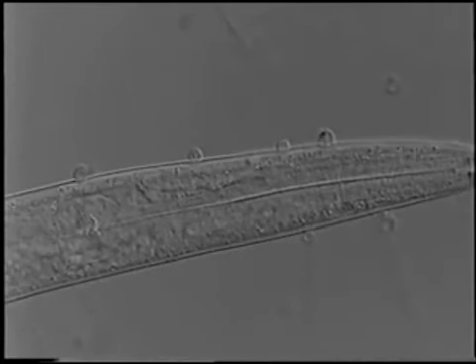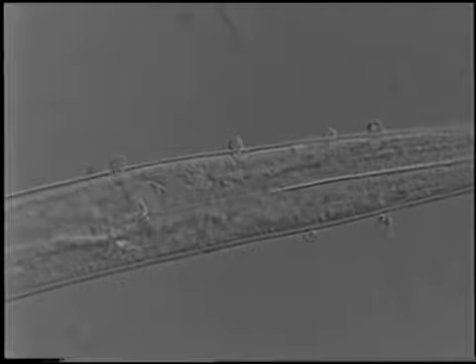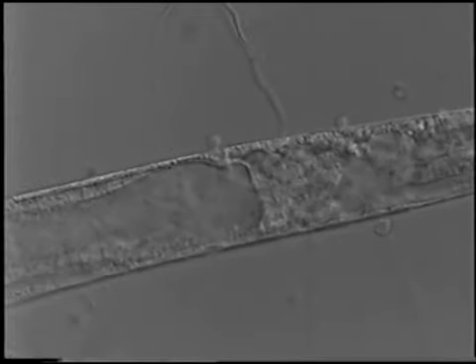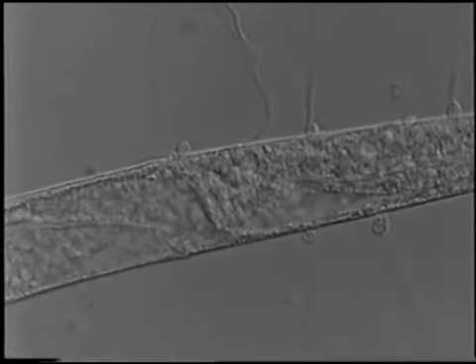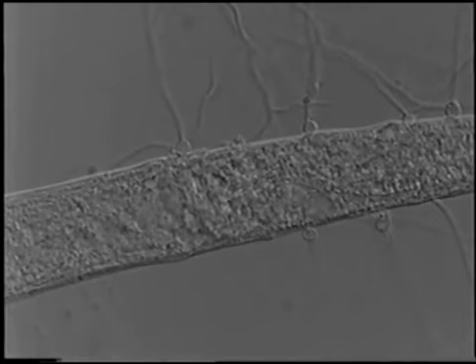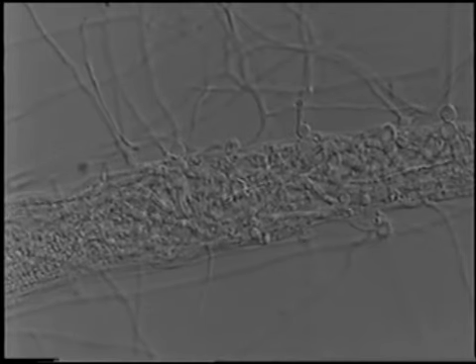When the infection bulb is fully developed, the collapse of the internal structure starts. Subsequently, vegetative hyphae develop within the nematode, and at the same time new hyphae grow out from the knobs. About 2 days after the start of the infection, a regular mycelium with new adhesive knobs has developed.